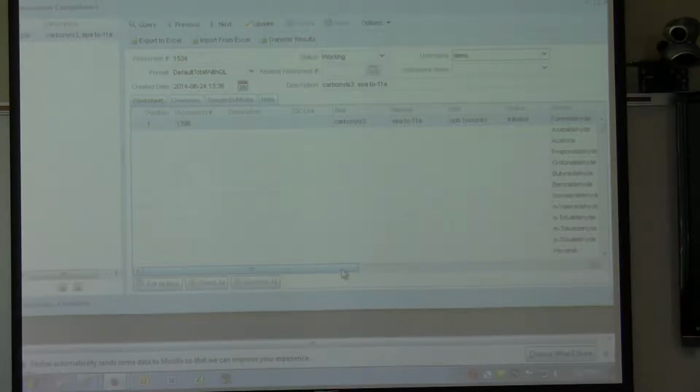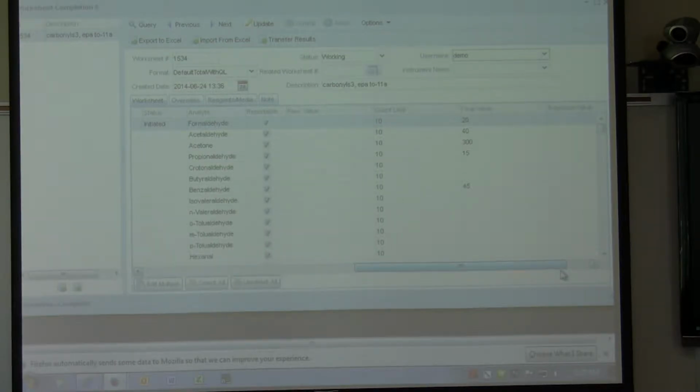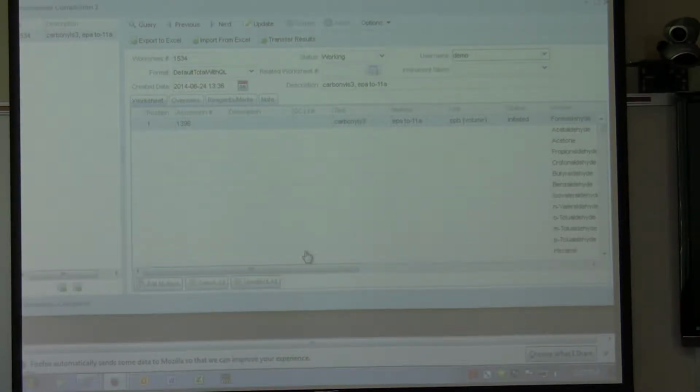Does this completion now, when you were putting it on the worksheet before you transfer it over, take the place of going into the M drive and transferring things onto the worksheet? This is for, like I said, if you don't have any formulas, or if all you're doing is putting in numbers, a very simple worksheet. Yeah, that could take the place of that. If you have complex formulas and you need your Excel file to do those formulas, you still have to export it, modify it, and import it, just like you would do now.